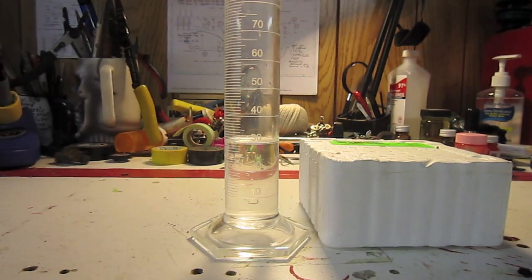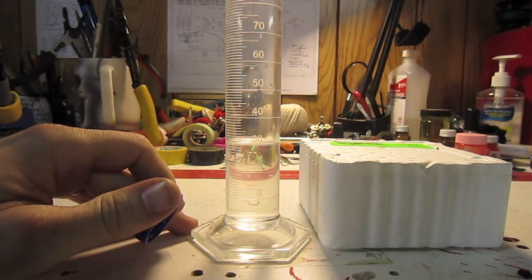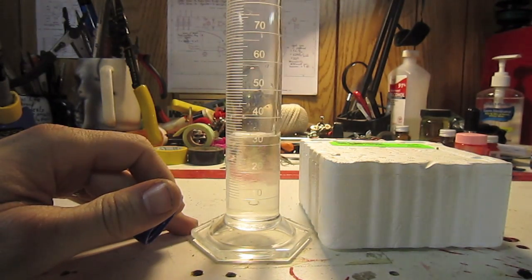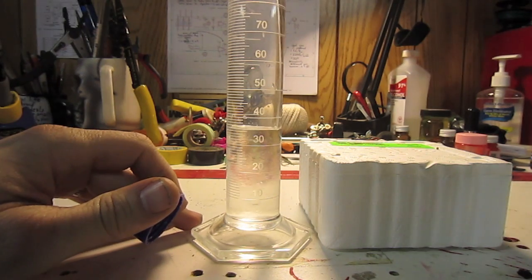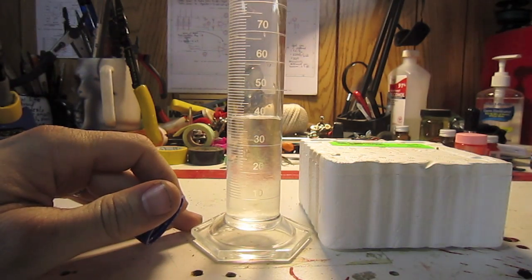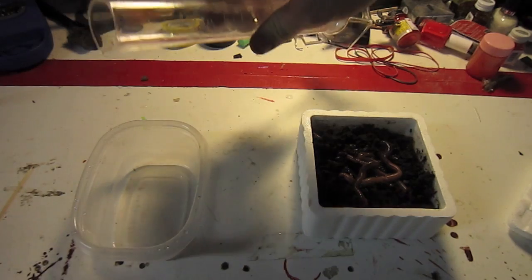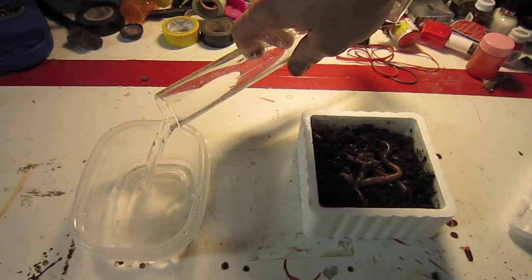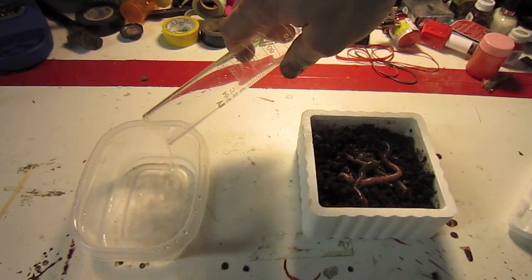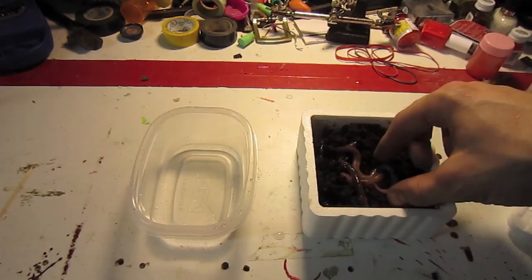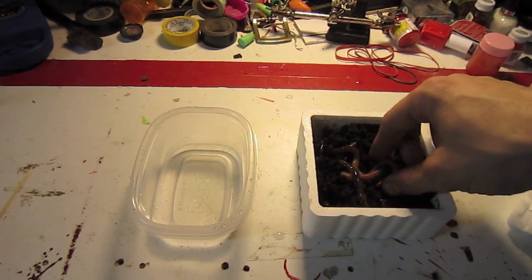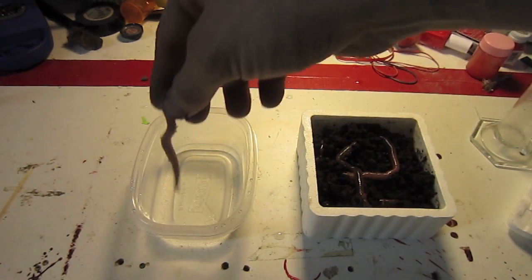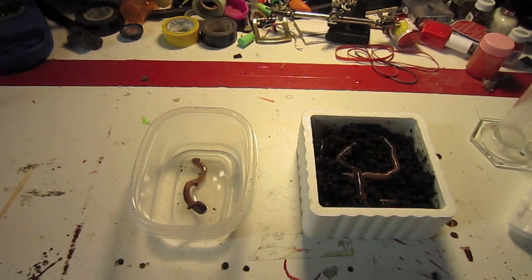Now, earthworms can handle cold temperatures quite well, so we have to use a chemical means to anesthetize them. I create a 10% alcohol solution by mixing 10 milliliters of 80 proof vodka with 30 milliliters of tap water. I take one of the healthy worms and put them in the solution, and wait about 7 minutes for the anesthesia to take hold.